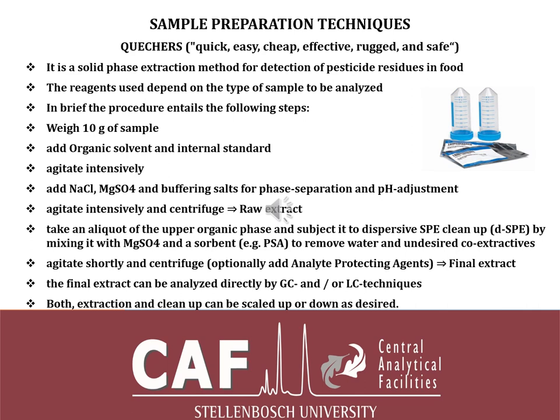Briefly, how does QuEChERS work? You've got your sample, you weigh the sample, typically 10 grams or 5 grams or more, depending on what you're working with. And then you add the organic solvent and the internal standard. You can also add water in there to wet your sample, because if you just add organic solvent on its own, you might not get the compounds out. And then you agitate. After that, you add sodium chloride and magnesium sulfate, with buffering to adjust the pH.